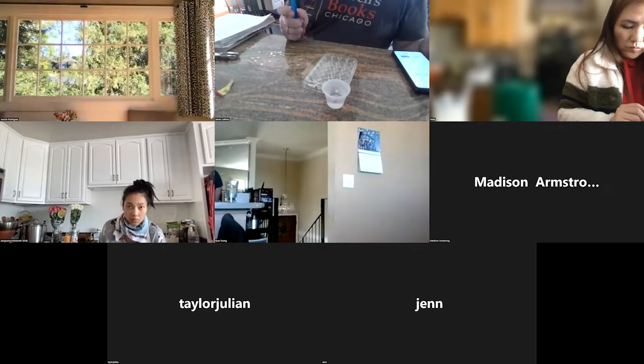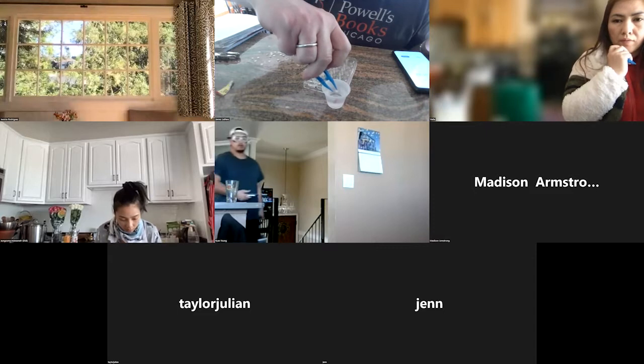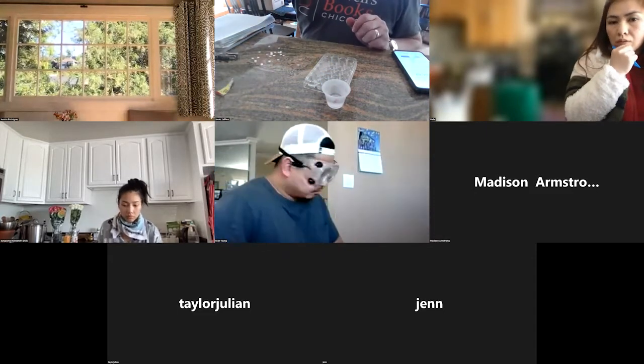Yeah, I got one of the 25% to pop up in 35 seconds, but maybe I didn't rinse it enough. So let's try that one again.